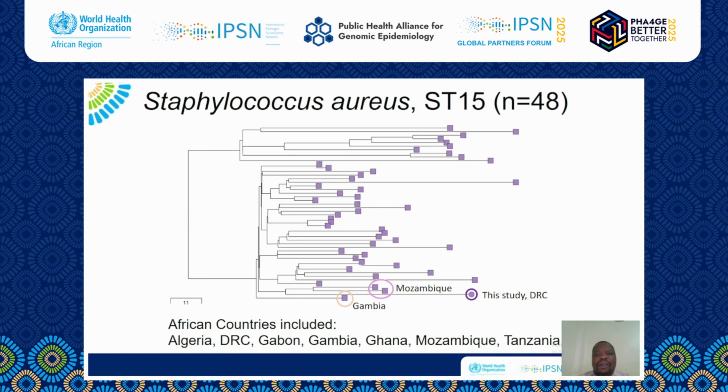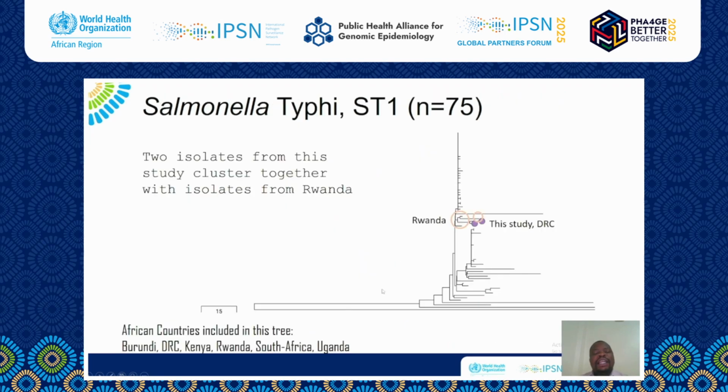The contrary has been observed with the Staphylococcus aureus sequence type 15, which clustered together with the one isolated in Mozambique.